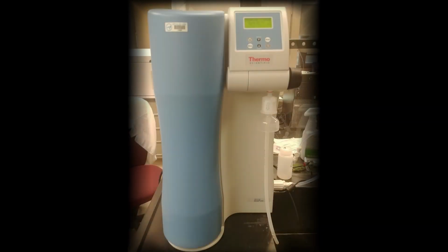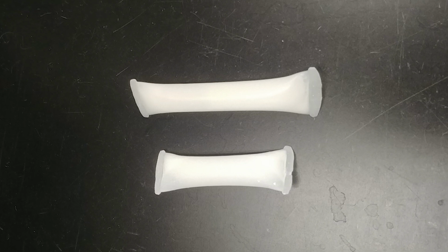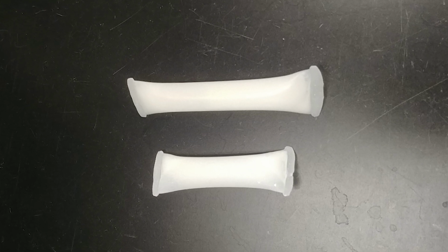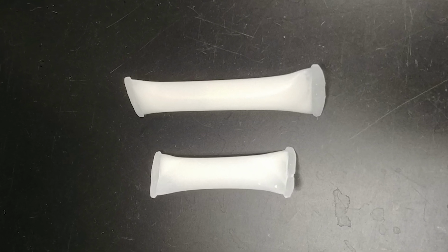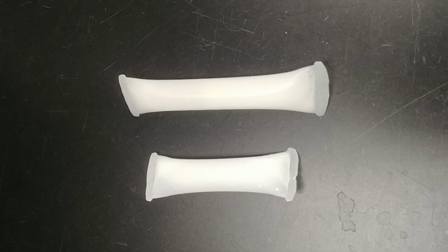Dilution water. Dilution water must come from a deionizing system, reverse osmosis, or distillation system. You can use whichever source is available as long as there are no heavy metals, chlorine, or microbes. The other reagent is a nutrient pillow packet. Nutrient pillow packets can be ordered from chemical supply companies. The nutrient pillow packets we have here are made for 3 liters or 6 liters of dilution water.